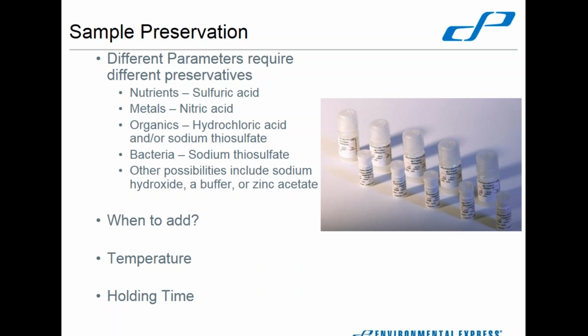Occasionally, if your sample collection site is really close to your facility, you may not actually achieve any temperature change at all, much less all the way down to that less than 6 degrees, I think, or maybe it's less than 10 degrees. Less than 10 degrees for some, less than 6 degrees for some, depending on what you're looking for in that temperature requirement. As long as you can demonstrate a downward trend in the sample temperature, then that is appropriate.